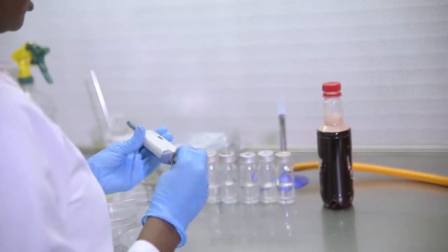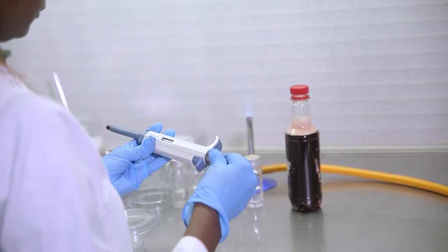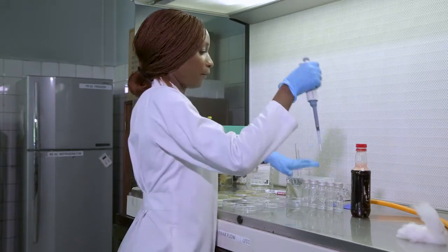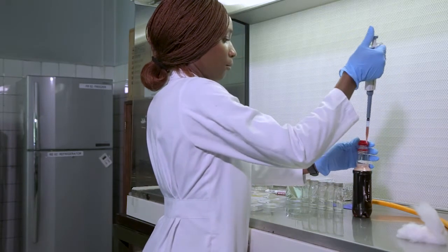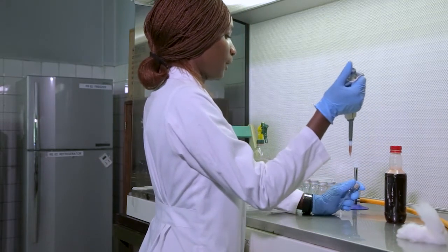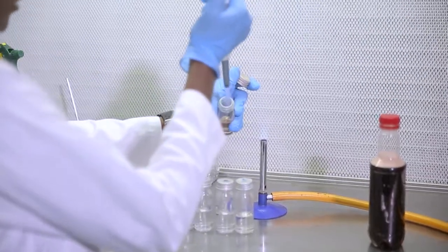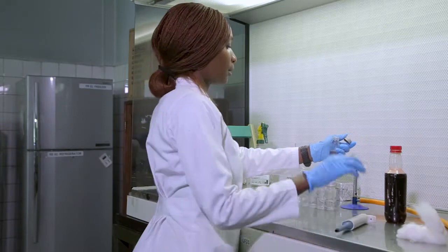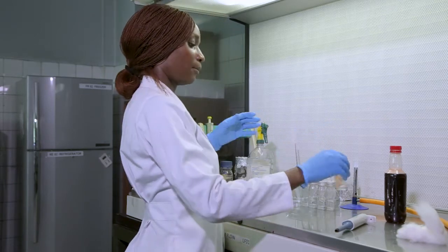So I'll adjust my pipette to 1 ml. So I'm going to pick 1 ml of the sample. And then I'm going to put it in 9 ml of the sterile diluent. So as you deliver this, you ensure that the tip of the pipette does not touch the liquid inside. Okay? So I can discard that. Close this. Make sure I shake thoroughly.